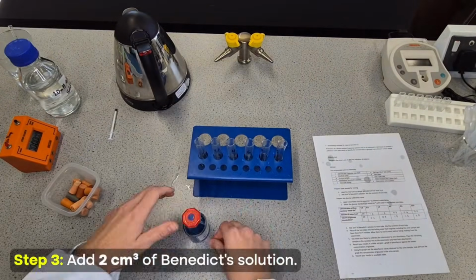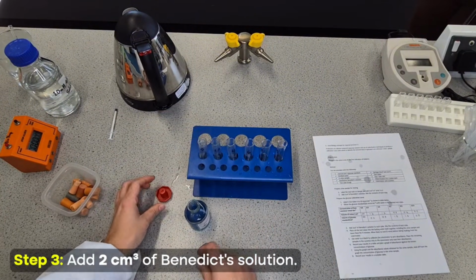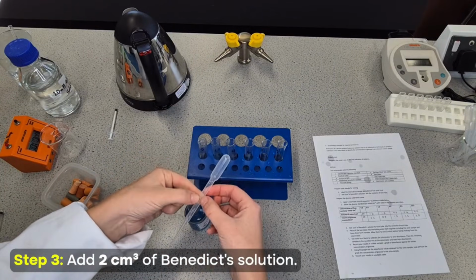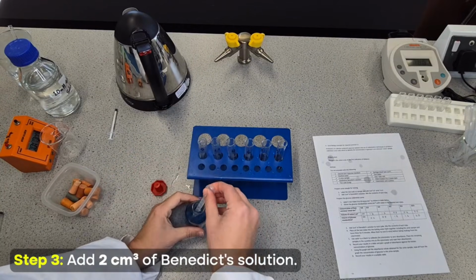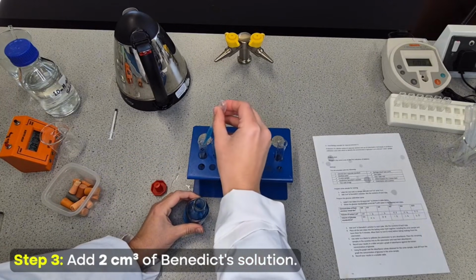So now we've got those mixed and we know they are equally distributed. I'm going to add the Benedicts. Now so that it can actually fit in, I'm going to go for 2 centimeters cubed, just using my dropping pipette into each of them.